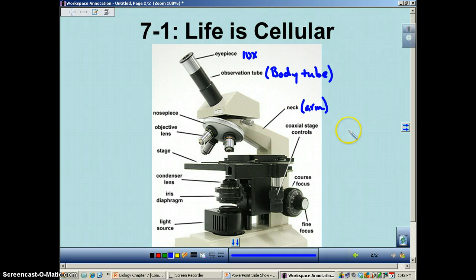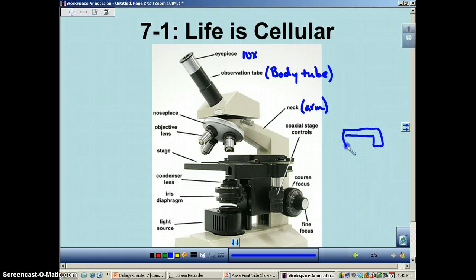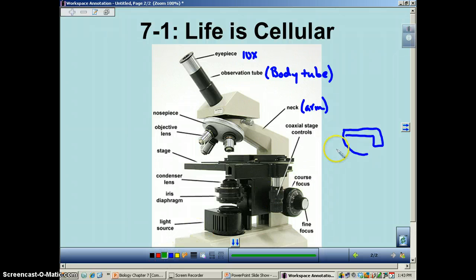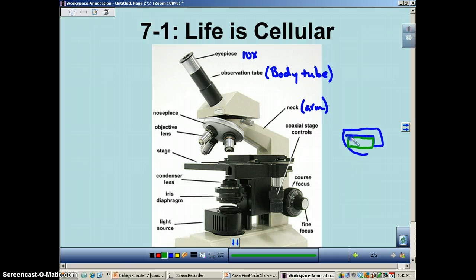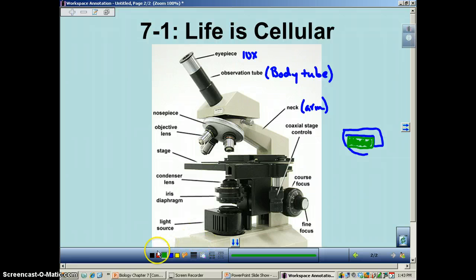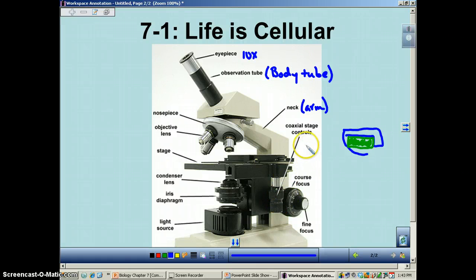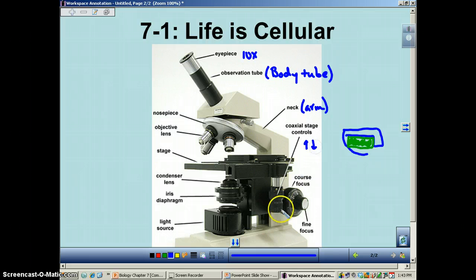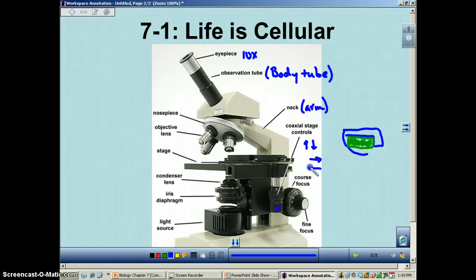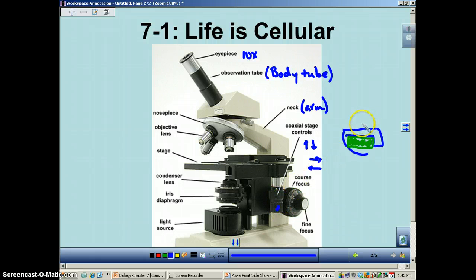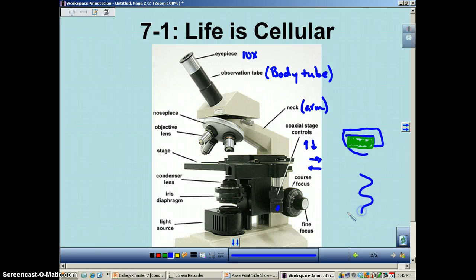This stage clip, if you look at it from the top, it's a piece of metal with a clip — the clip holds the slide right there. You're going to use these manipulators: this one on top will make it go front and backwards, and this one on the bottom will make the slide go back and forth. If you've ever seen an Etch-a-Sketch, they're basically those kind of controllers. You can manipulate these two at the same time to move the slide around the stage.